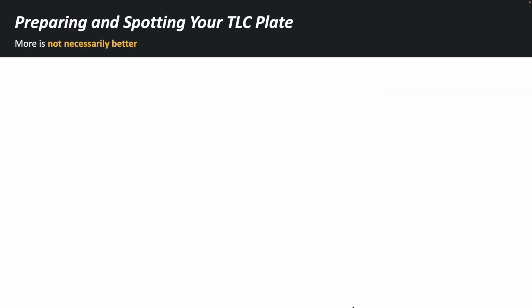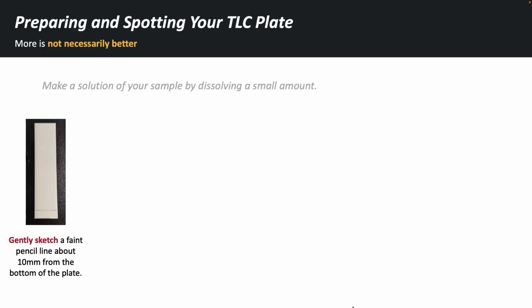I'm not going to walk you through the entire protocol here, but there are a few things that I want you to take a look at before you embark on your own experience with TLC. You're going to begin by making a solution of your sample and dissolving a very small amount of it into a solvent. TLC is a very sensitive technique.